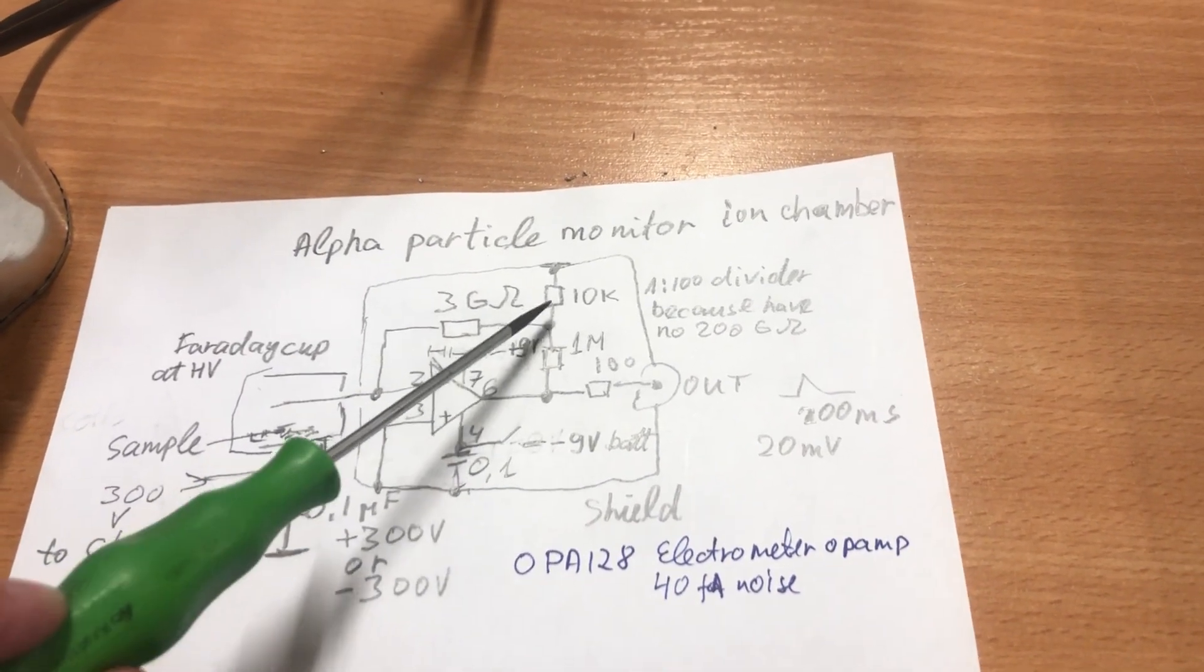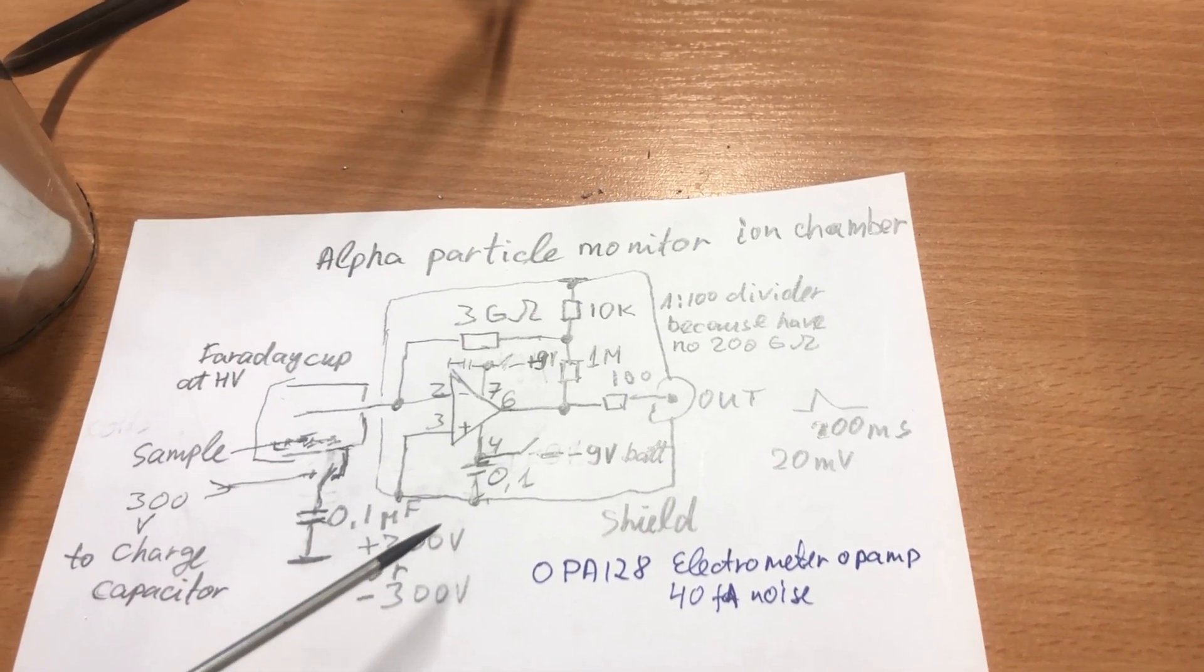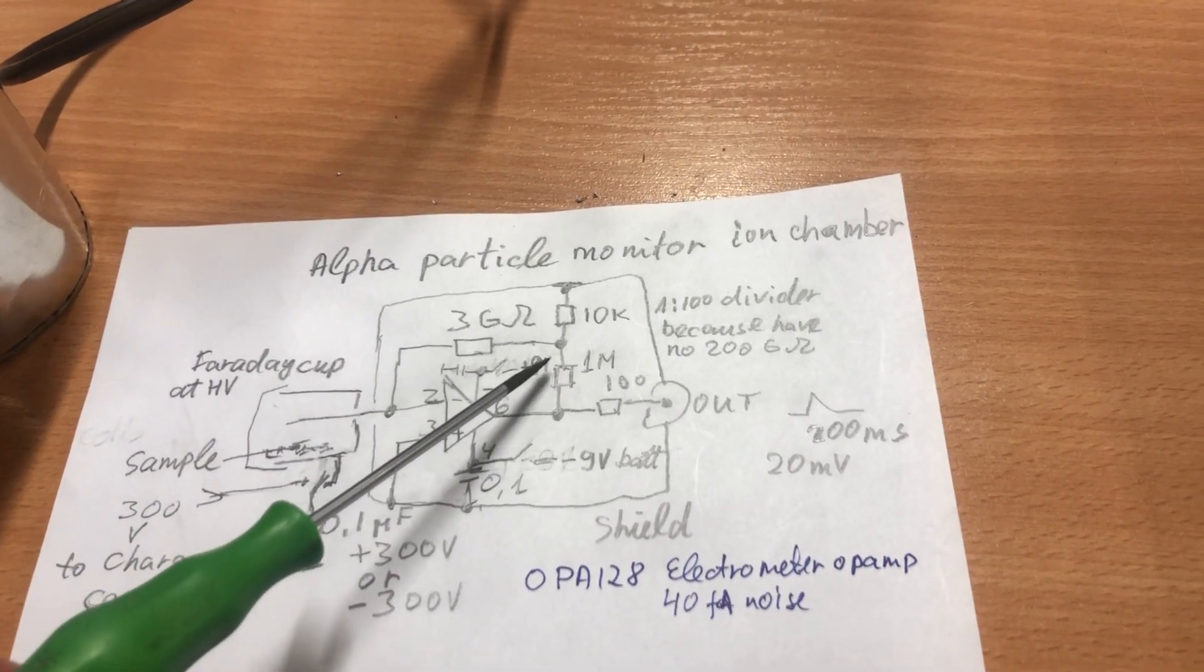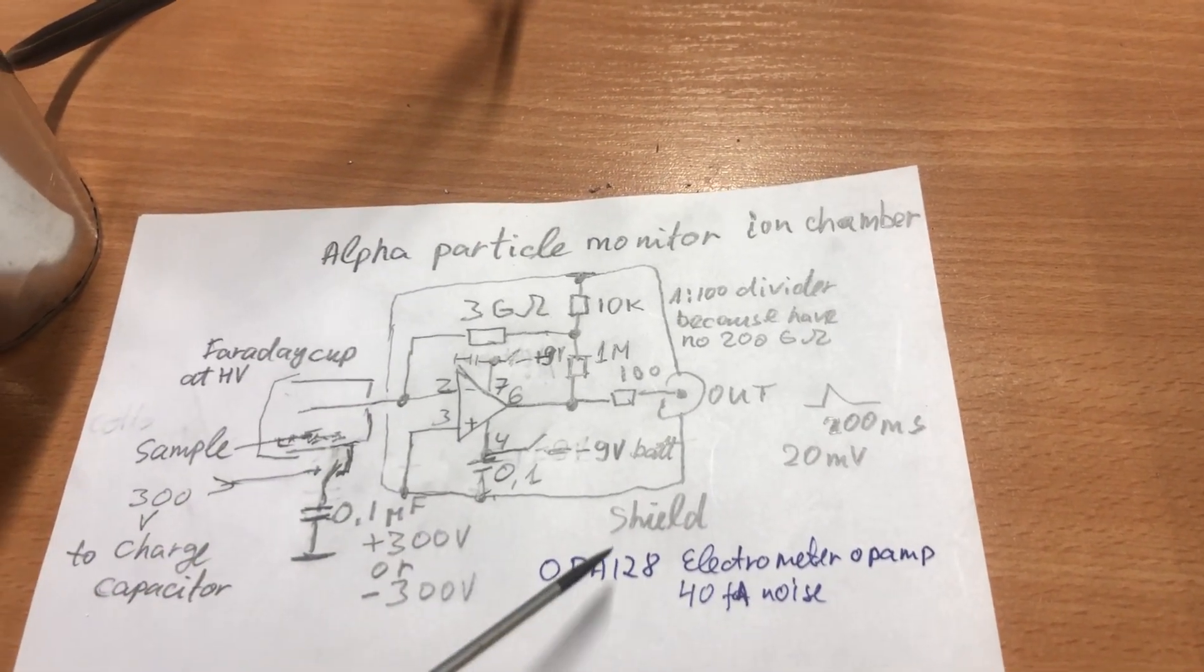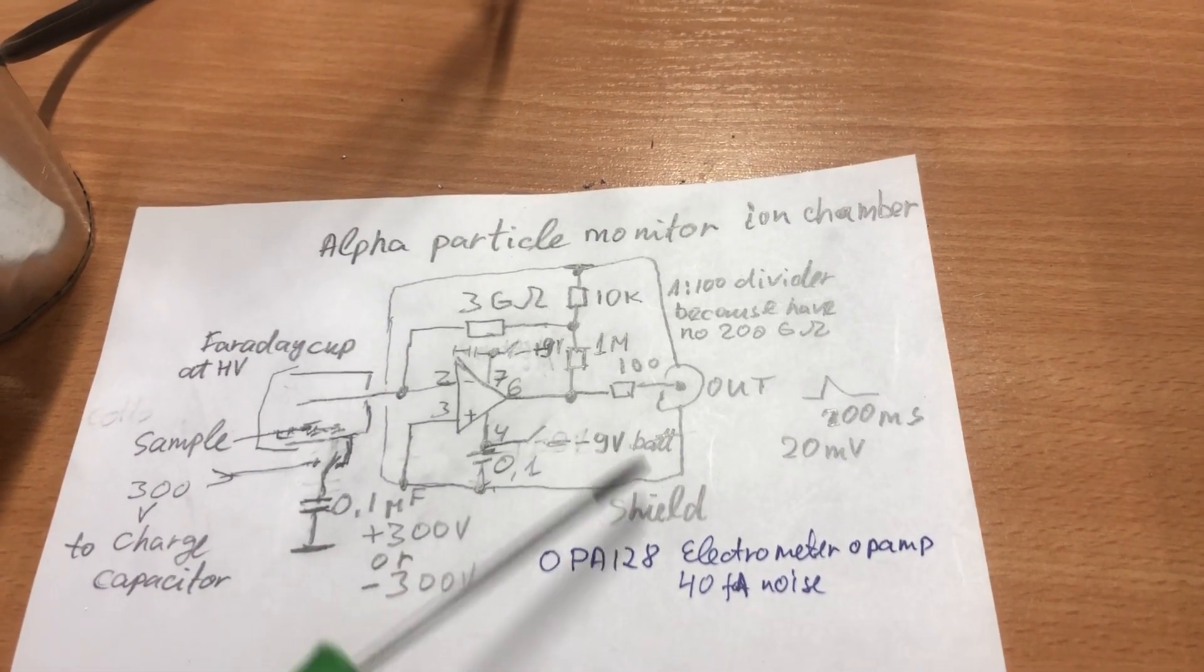And the trick is to use a voltage divider on the output which makes this feedback resistor effectively larger by a factor of 100. 100 ohms protect against self-oscillation.